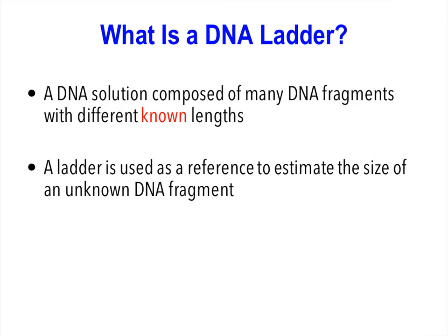Hi everyone, this is going to be a quick tutorial on how to use your DNA ladder or standard to estimate the sizes of your fragments of DNA. So first, I just want to review the DNA ladder, or standard, or marker, that we use whenever we run an agarose gel. It's a DNA solution composed of many fragments of DNA with different known lengths. So it's a set of pieces of DNA and we know their sizes. And we have a ladder as a reference to estimate the sizes of our unknown fragments.